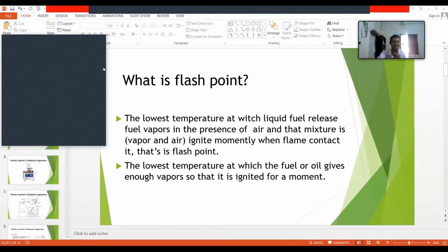Okay, that's nice. Siam, do you hear? Yes, sir. Do you know the temperature which we found as the flash point for the diesel? 77, sir. Okay. Next, do you know the temperature? 79. Very good. I will note it for you. Okay, that is 79 degrees Celsius.